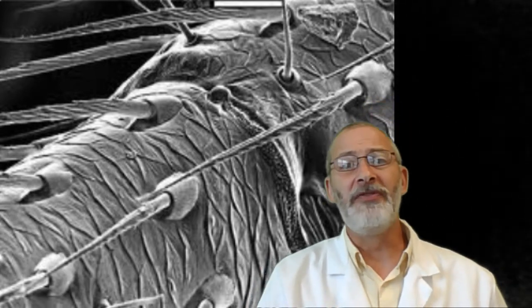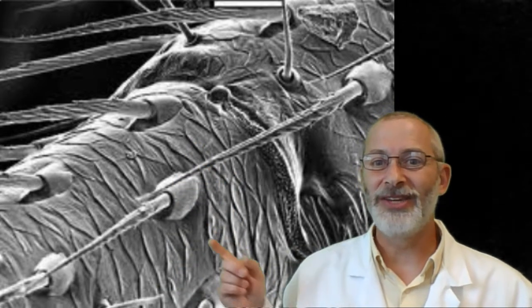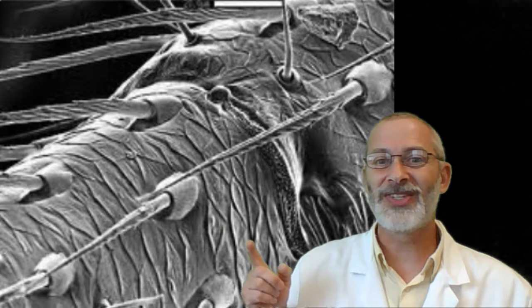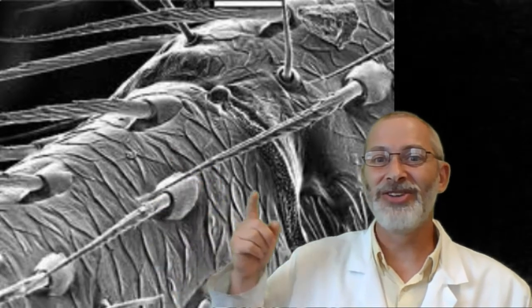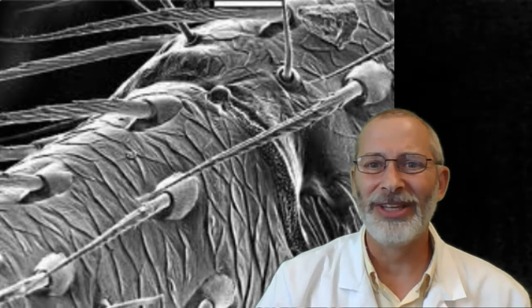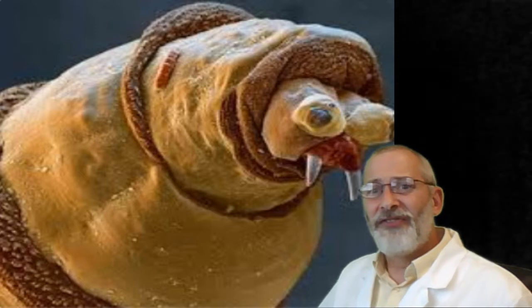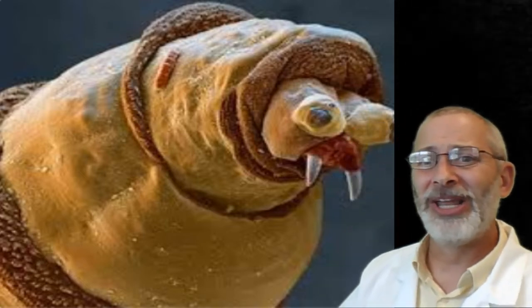Ooh, and if you've ever had a picnic, you've probably been visited by a fly. Here's the leg of a fly, and here's the skin. Check out his skin and the hairs on his body. Oh, yes. What a lovely thought. Looks like he needs a shampoo. Oh, goodness. Now, there's a face only a mother could love.